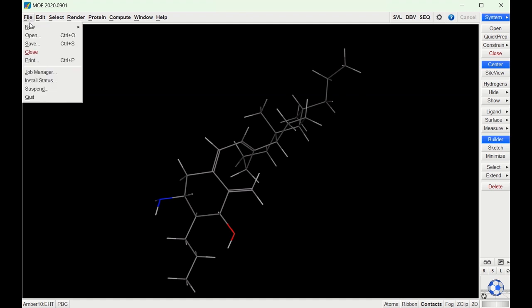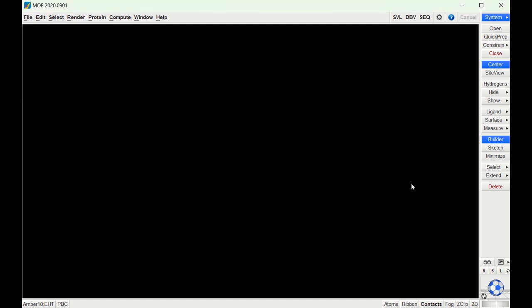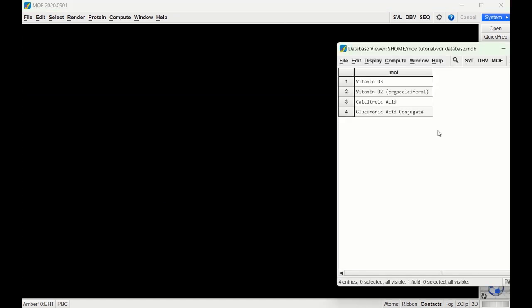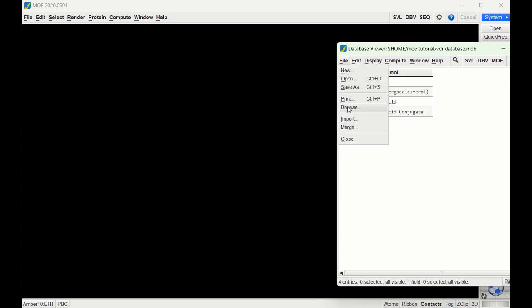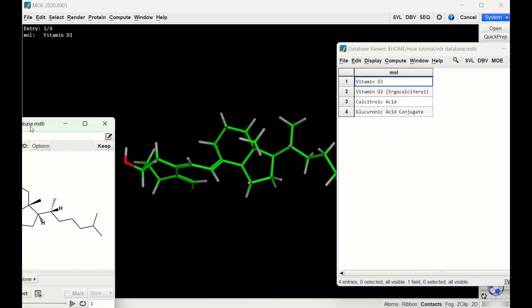So now let's close this out and I'm going to draw a few more structures in the database that we'll then use to dock into MOE. Back in our database I have a few more structures drawn here. Another way you can view these is to hit File > Browse — it'll bring up this screen where we can see the structure and it'll also put the three-dimensional structure in MOE.